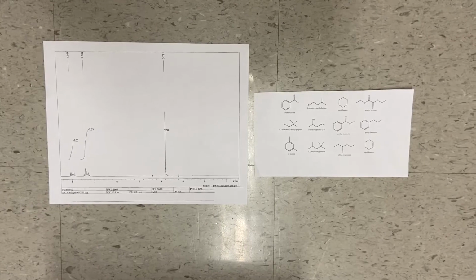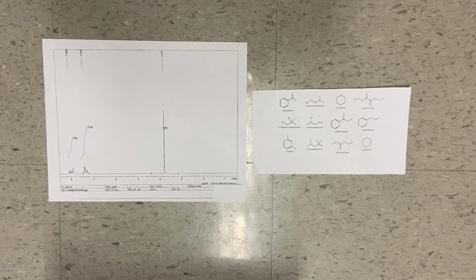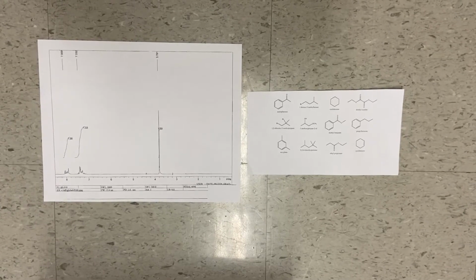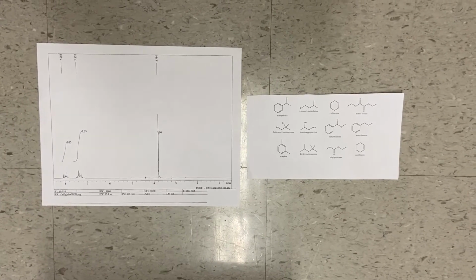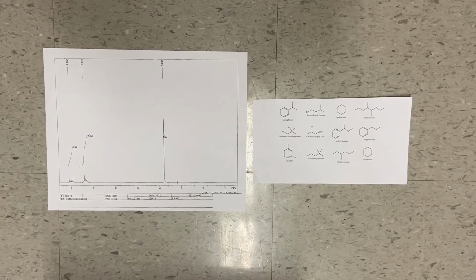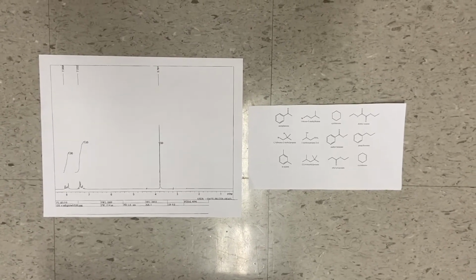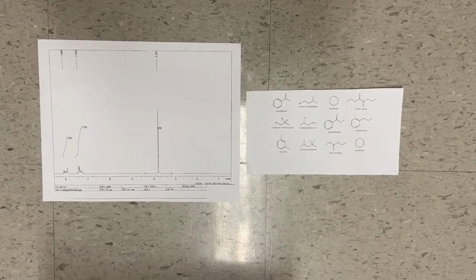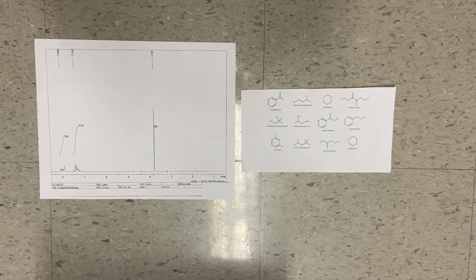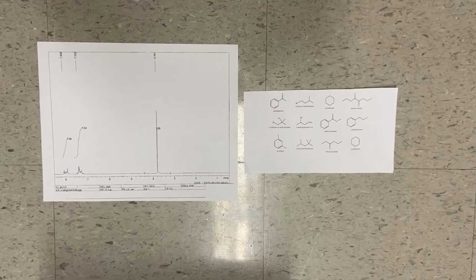along with a drop or two of tetramethylsilane. TMS is used as a reference point that is set at 0 ppm. After these are added, the NMR tube is capped and shaken lightly to mix the sample together to get it ready for NMR analysis. A collar is placed around the tube and the tube is decontaminated using a Chemwipe.